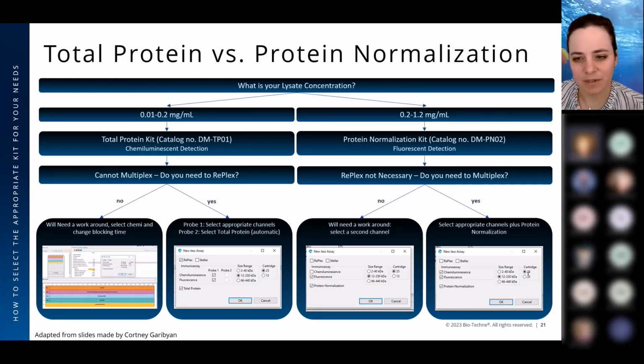So the separation time, some people would increase it to increase resolution between closely migrating proteins, or the higher molecular weight proteins, to get them to migrate lower. But on our platform, we do not recommend that you go more than 31 minutes of separation time. We don't want to run the 1 kD off the capillaries because that's one of our internal standards that we need for the software to calibrate.